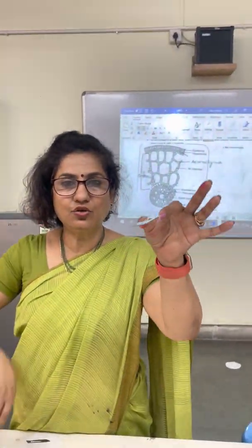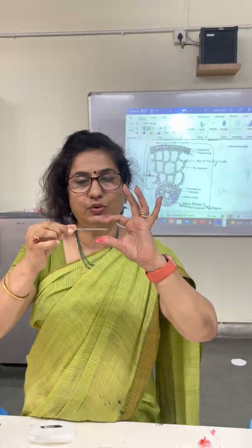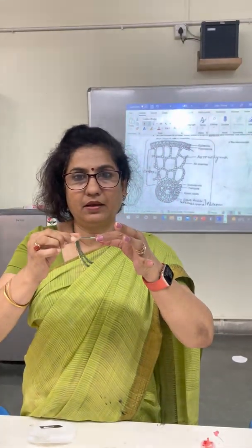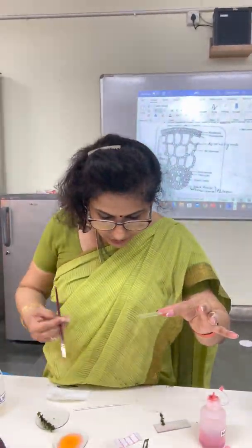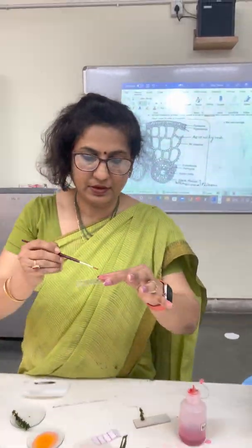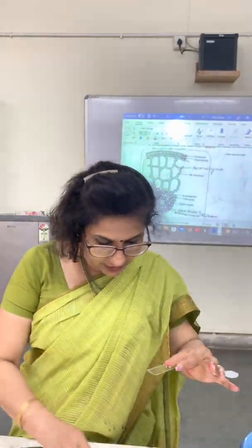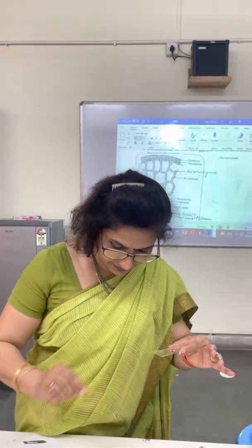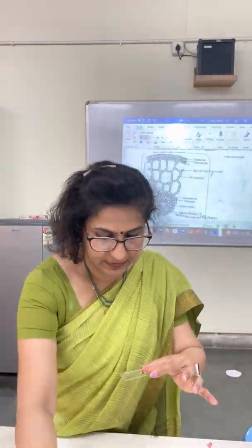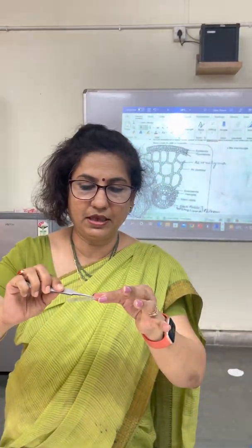Make sure that you hold the slide correctly so that it does not get stained unevenly. With the help of a brush, transfer your thinnest and well-stained section onto the slide and cover it with the help of a cover slip. While putting the cover slip, make sure that there are no air bubbles and it is evenly spread.